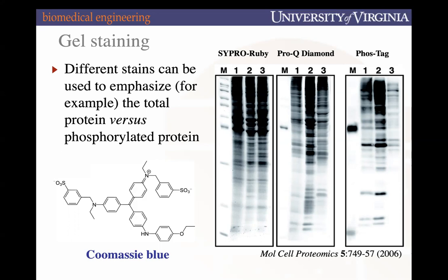You know what the molecular weight is here for each of those bands. Typically, if you're looking for a specific protein at a specific molecular weight, and you're not interested in using antibodies to detect it, for example, if you have a bacteria colony that's expressing a certain protein and you just want to see, should I see a thick band here designating that protein versus a normal bacteria that doesn't produce it, this is a helpful way to quickly stain it and see on a native gel, are we getting our protein of interest? And again, this is looking at it by molecular weight for total protein.